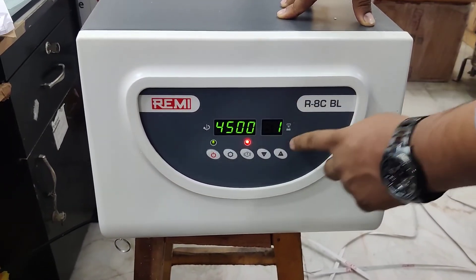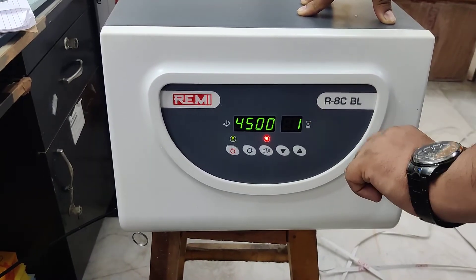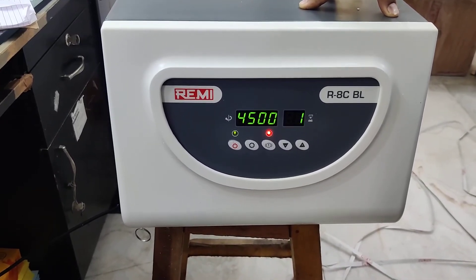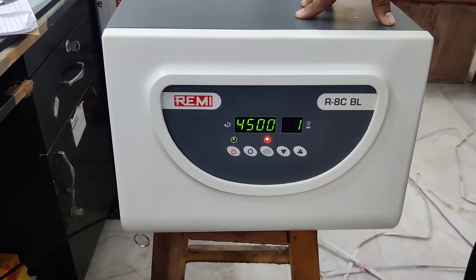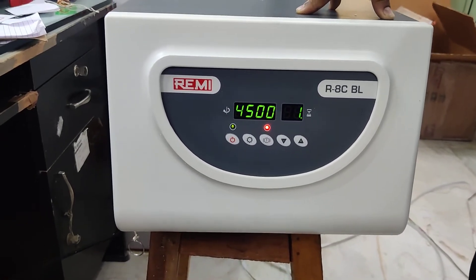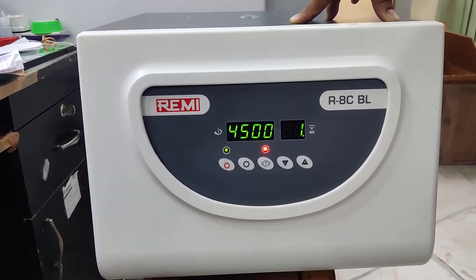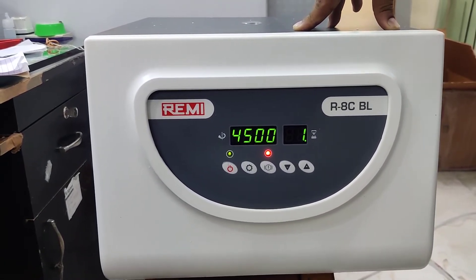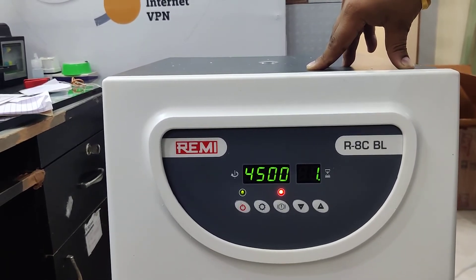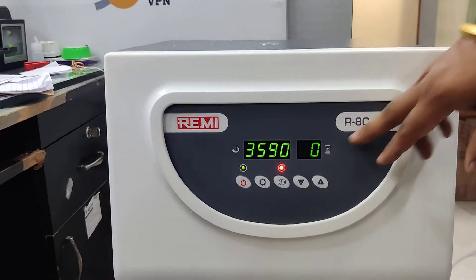Once it has reached the desired RPM, the timer will start. As you can see, there is a dot over here indicating the timer has started. Once one minute is over, it will automatically stop. The one minute is now over and the RPM will start reducing.